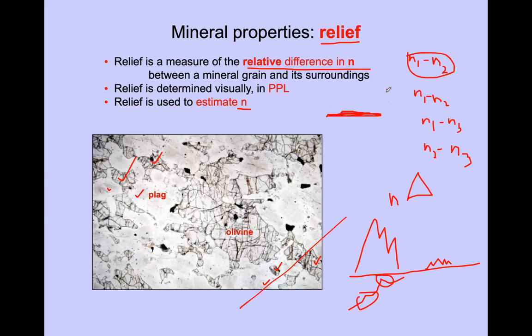So when you have a rock here, the slide here, and you have a glass, and this is, say, the mineral. So you have a glass here, and on top of the glass you have a glue. On top of that the sample is pasted, right?